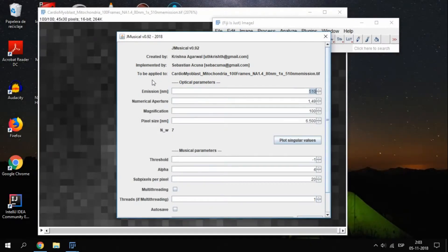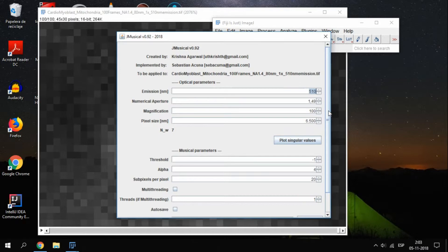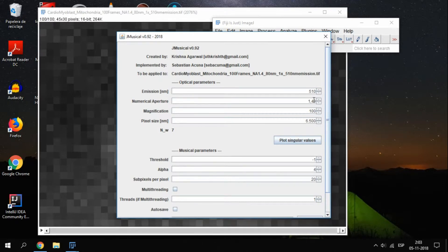The first group of fields are the optical parameters, and you need to know them beforehand. The emission depends on the fluorophore you are using, and it needs to be in nanometers. For this particular image, it is 510. The numerical aperture is given by the optical system, which is, in this case, 1.4.